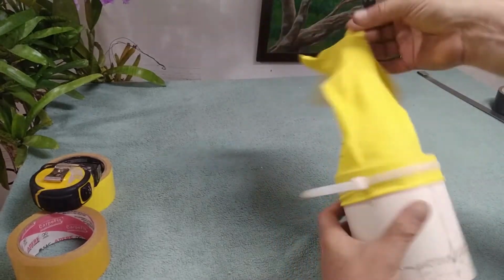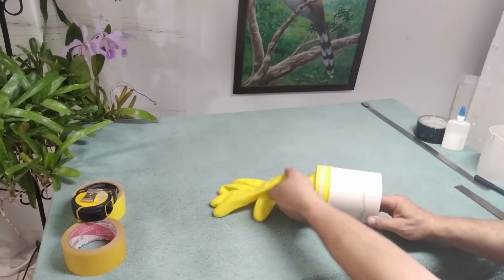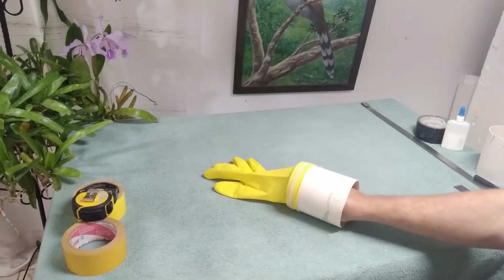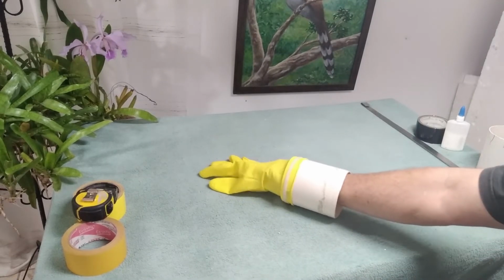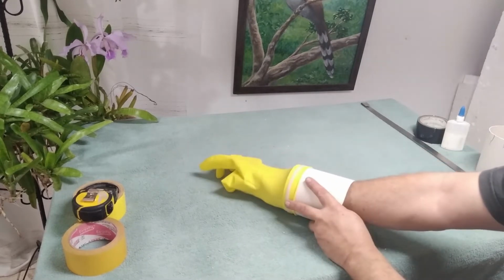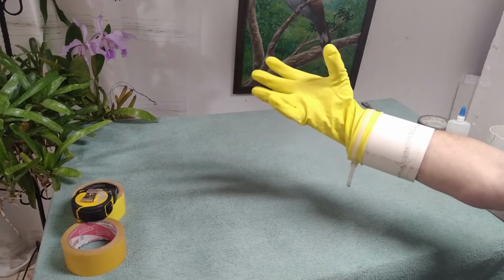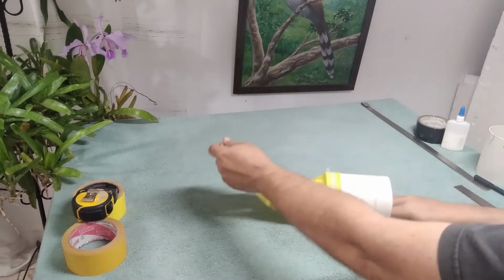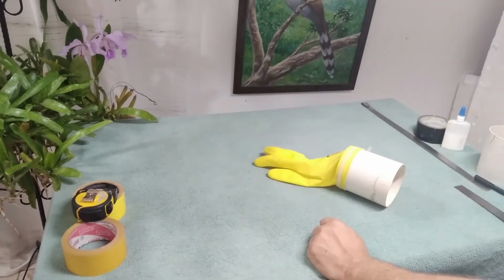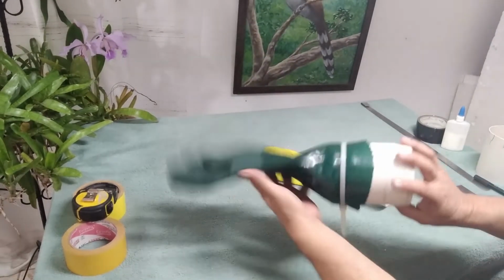This kind of glove lets you feel the touch of small things you manipulate inside the box. But watch this. Even the extra large glove won't let you slide your hand in easily without help from the other hand. That's why we need an even larger glove for the left hand. It will not have help from the right hand.